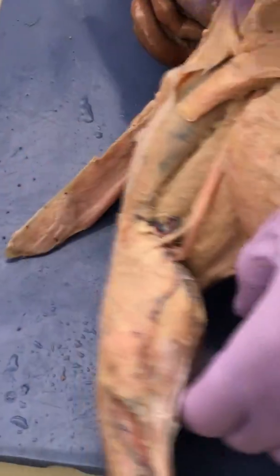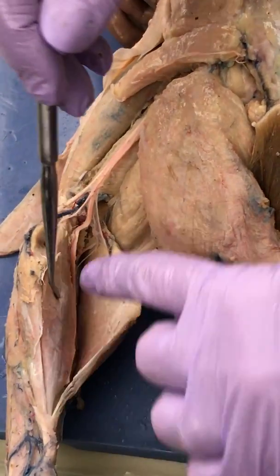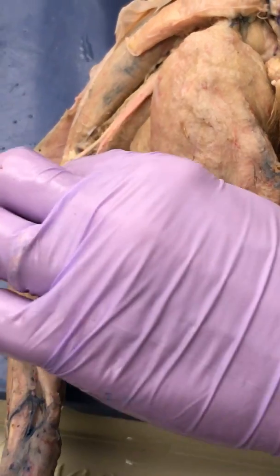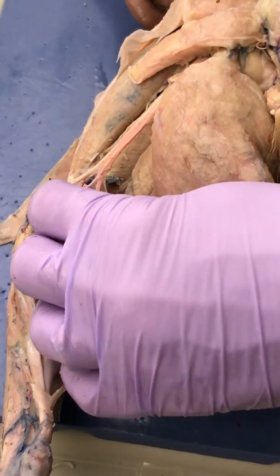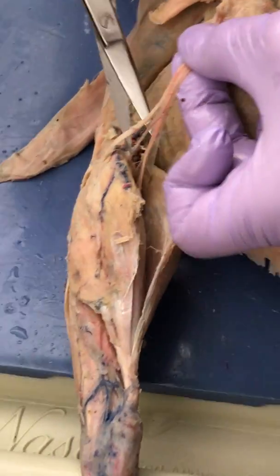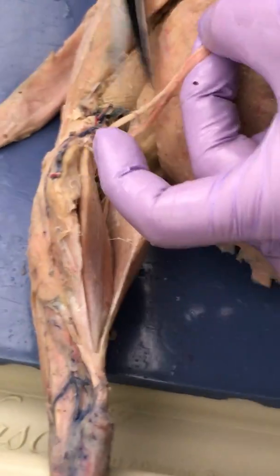What muscle are we going to pull apart to see the tibials? Oh Lord. What's the name of this muscle that I just pulled apart? It starts with an E. No, it does not. Okay, gastrocnemius. You did better than me. I'm thinking the little hot dog on the front end of the leg. Because I was like, wait, there's another hot dog here. It's okay. We just have these two left.